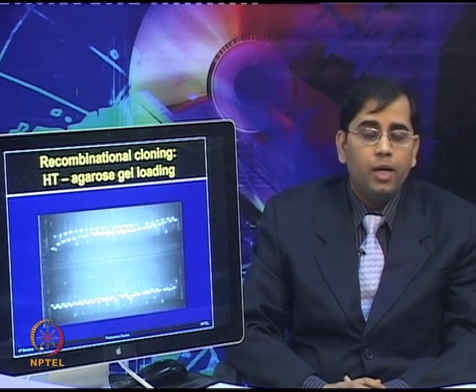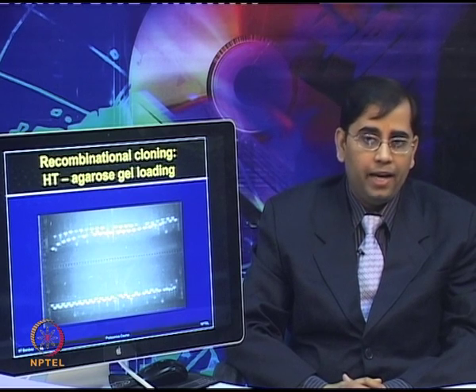Now, let us look at this image of the high throughput agarose gel loading. So, once the reaction is done, as we loaded in the last slide, after that you can visualize the gel from the ethidium bromide staining. So, these reaction setups can be performed by liquid handling robots, and agarose gels can be loaded by the robotic system.